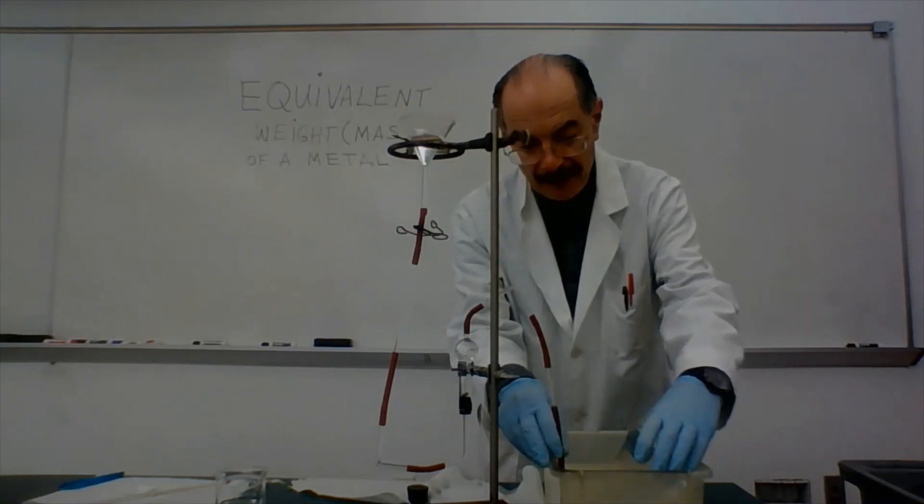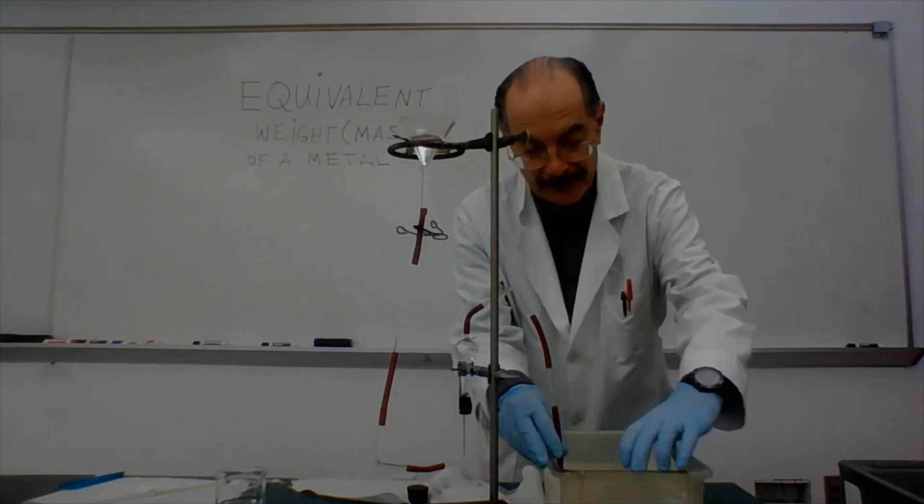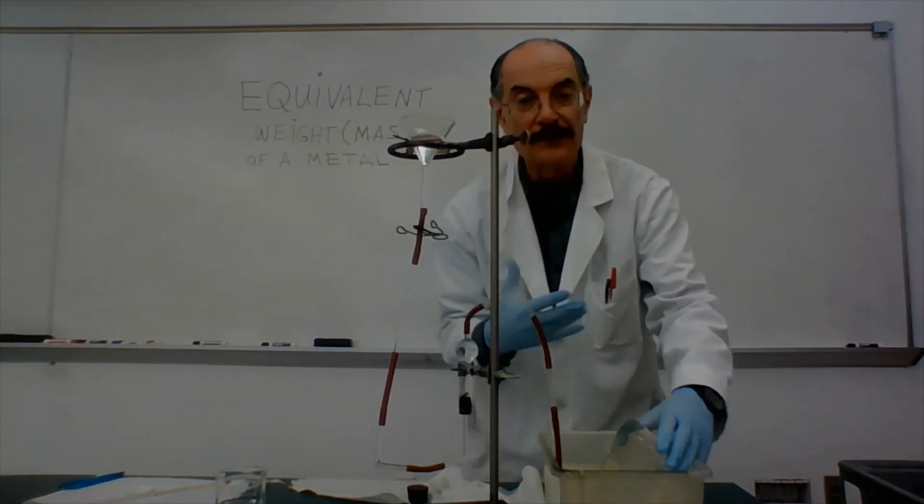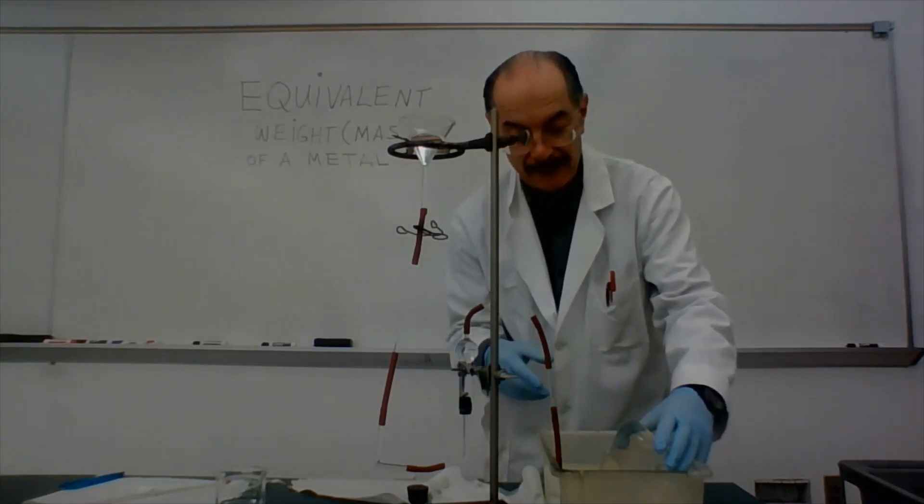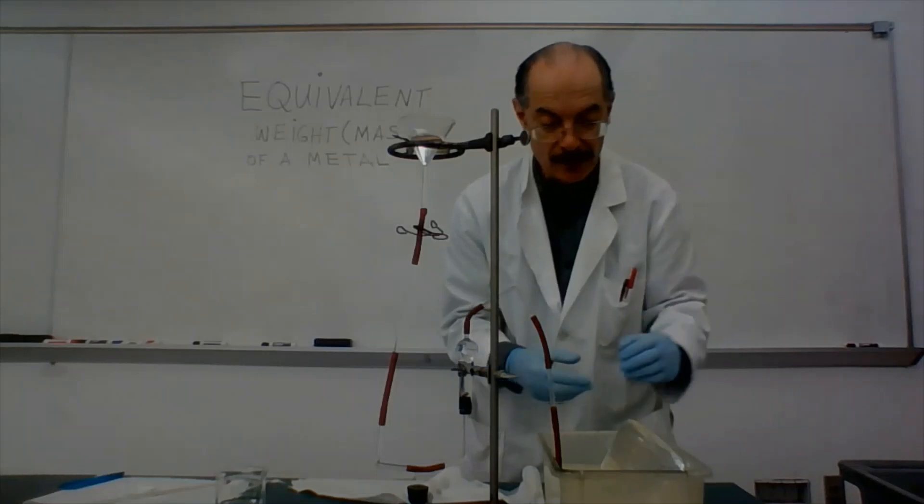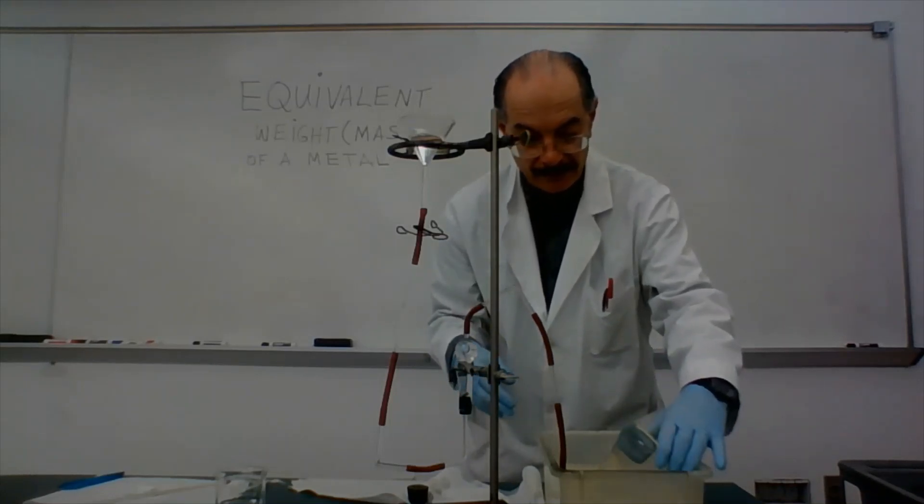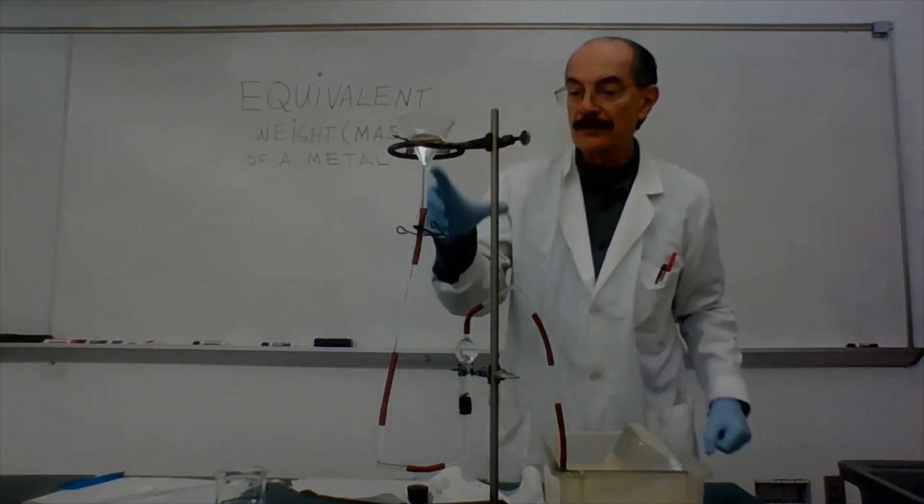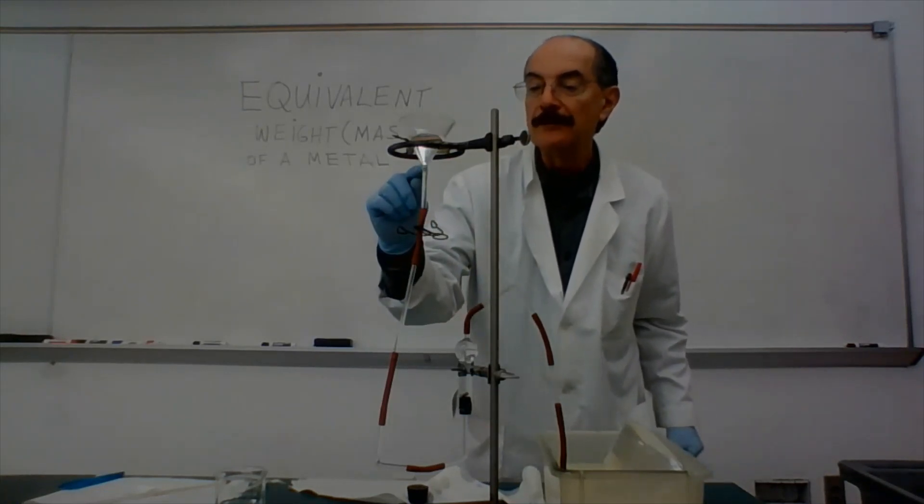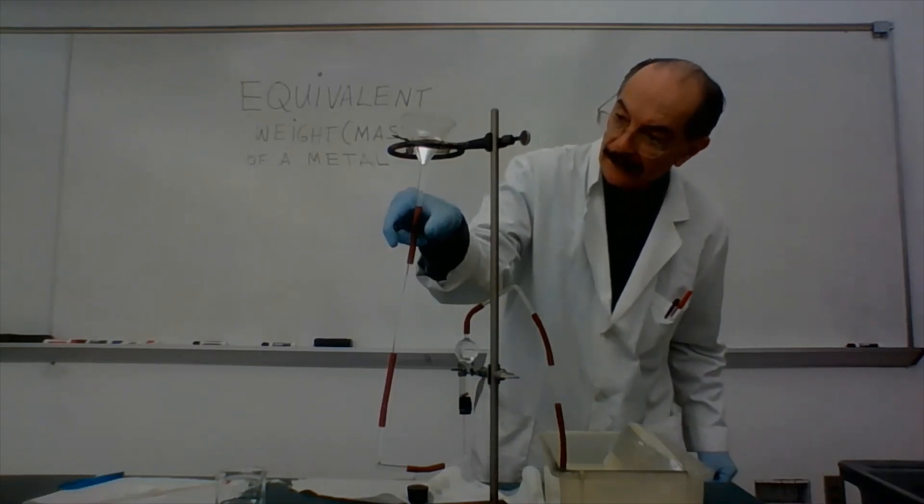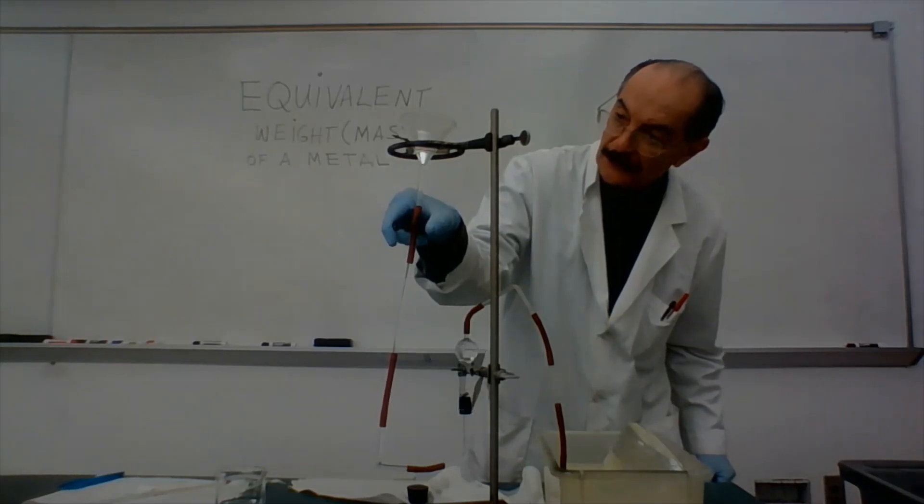Now if you're doing the experiment, you want to place this in a way where it won't slide off or fall down. You don't want it dancing around. So probably what will happen is during the experiment, you may want to have one of your teammates here can hold the flask in place while the reaction goes through, just to avoid any sudden vibrations to kind of jar it loose and make it fall into the water and then cause you to lose your sample. So I'm almost ready to start here. And now what I'm going to do is I'm going to open the pinch clamp and let the water drop to basically the bottom of the cone of the funnel here. And now very carefully, you don't want it to go too far down because you don't want to trap any air bubbles in here.